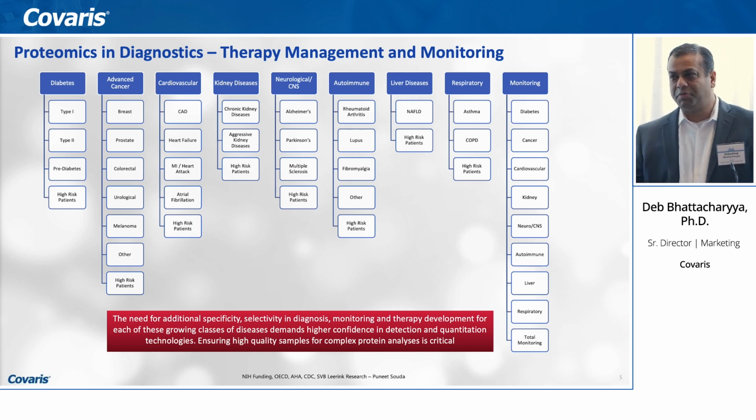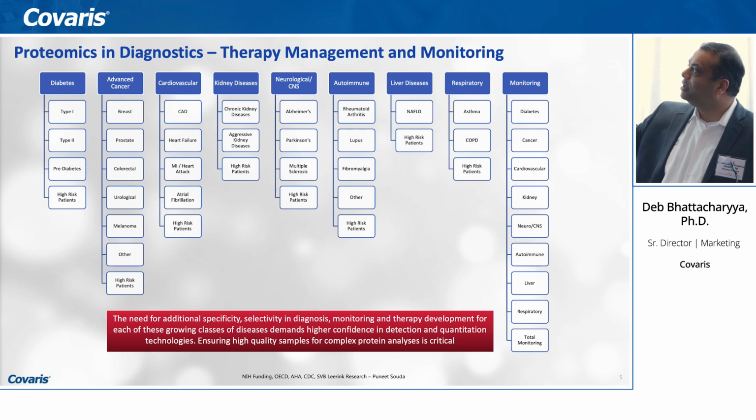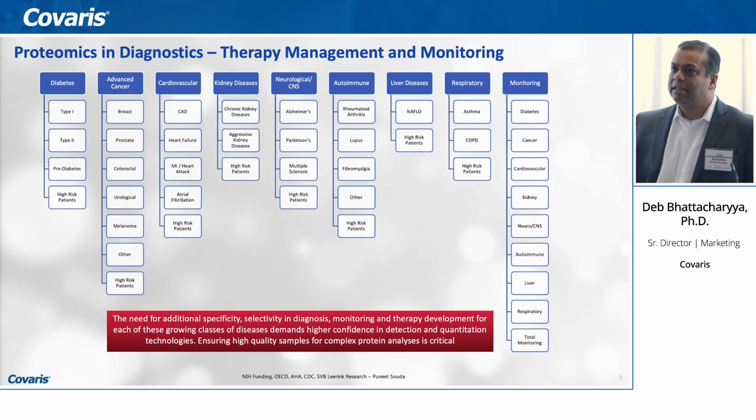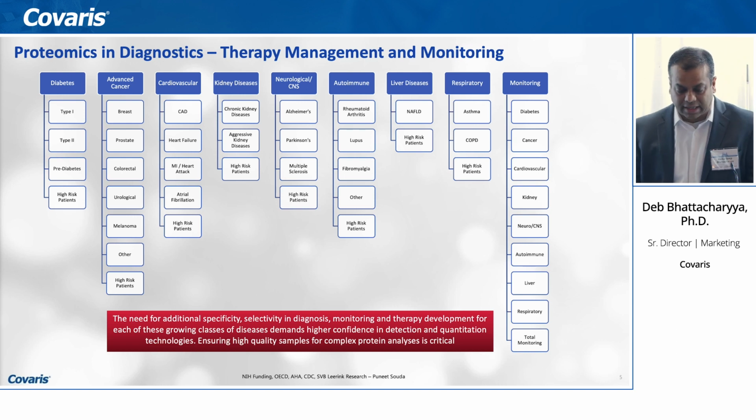it's fair to say 40% of drugs or therapeutics that are approved by FDA on a year-to-year basis are actually large molecule-based drugs. So you think of Humira, you think of Kadcyla, these are all monoclonal antibody-based therapeutics. So that is very targeted, but then across the board, when you look at different kinds of diseases, there are a lot of these protein-based therapeutics that are actually becoming very, very important in terms of biomarker-based analysis.